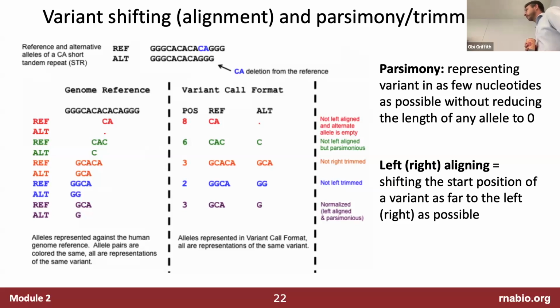So the big picture question is if you're working with a non-human species, like let's say dog, where the resources and even reagents are more limited, so that, for example, you don't even have good ribodepletion kits, so all of your RNA-seq data is poly-A enriched. Is it even worth dealing with some of this stuff?